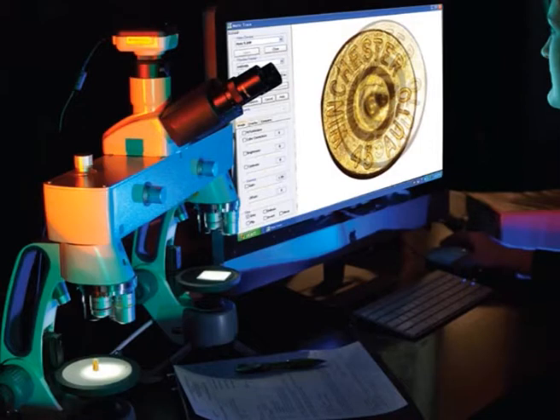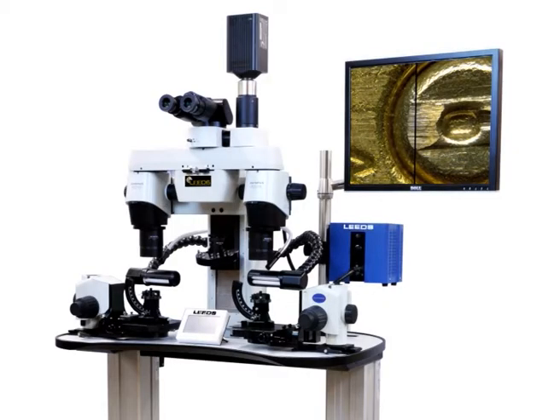However, modern instruments are now attached with a closed circuit television (CCTV) and a monitor connected to an additional video recording device. With this type of assembly, it is now possible to record the striation marks around the whole circumference of a bullet.